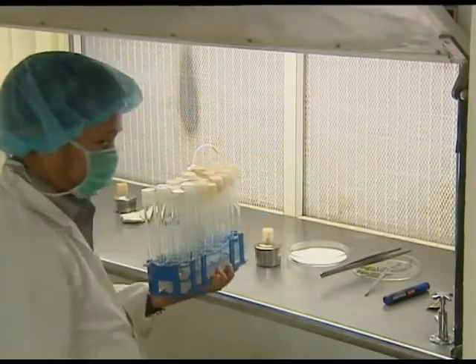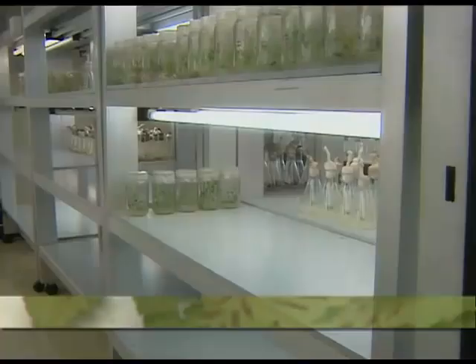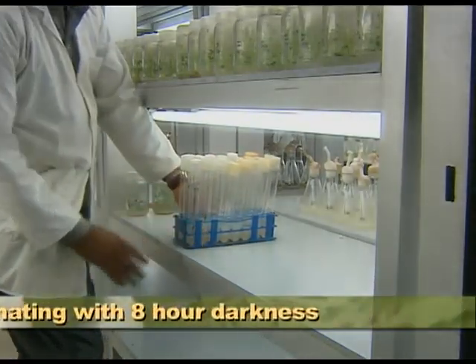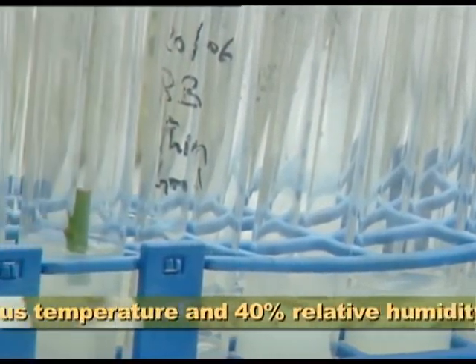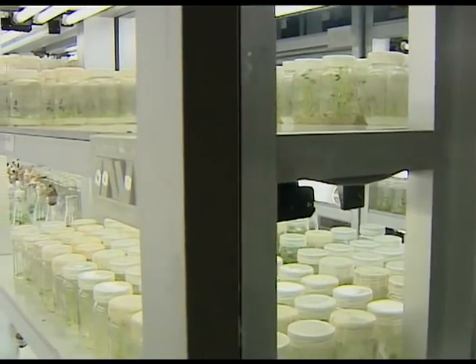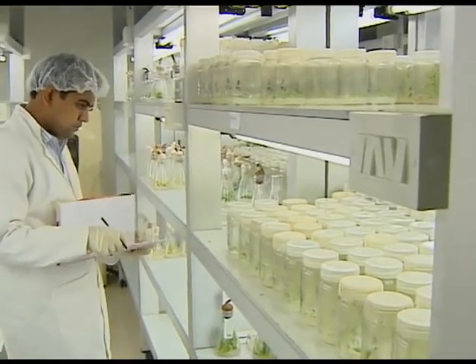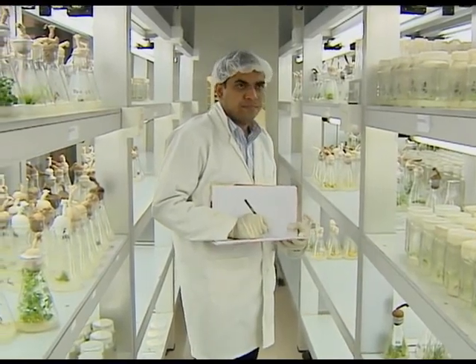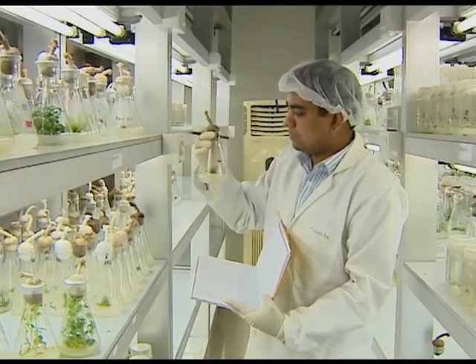The cultures are now ready to be incubated in the culture lab at optimum conditions of 16 hours light alternating with 8 hours darkness, 25 to 27 degrees Celsius temperature, 40% relative humidity, and it is monitored timely. After a few days, which may range from 5 to 15 days, all cultures with either bacterial or fungal contaminants are removed and the remaining cultures are allowed to grow further.